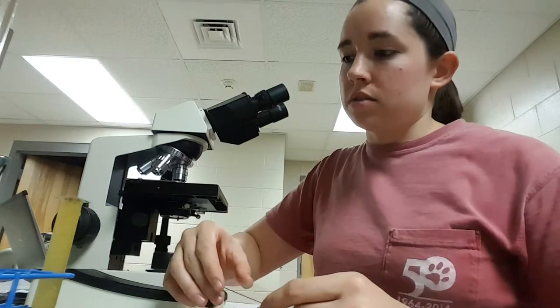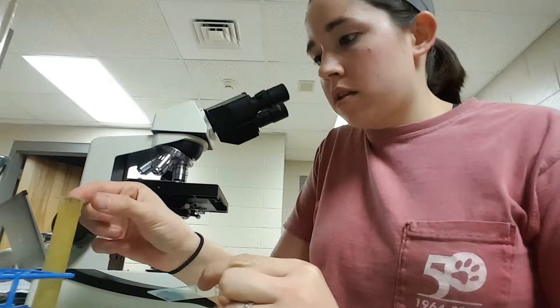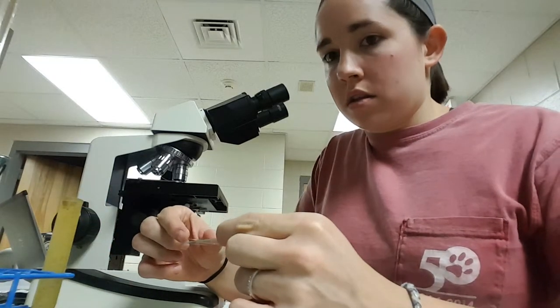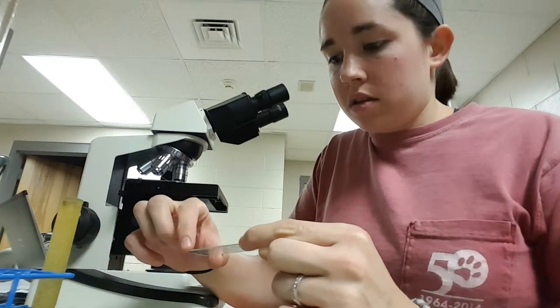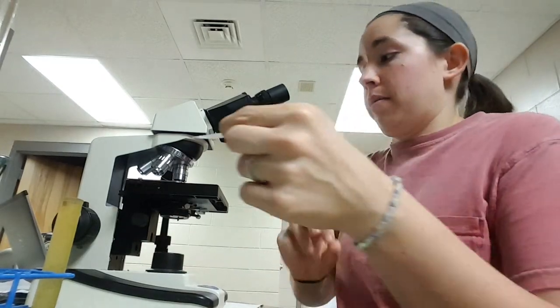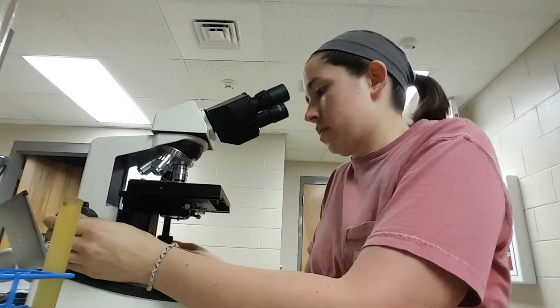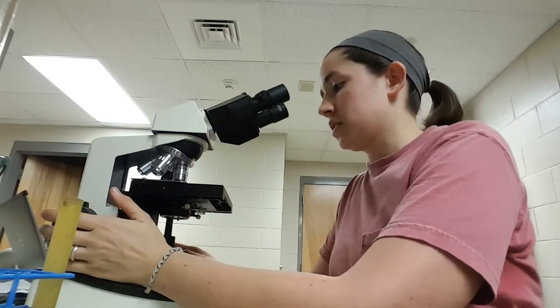Okay, 15 minutes has passed, so I'm going to remove the cover slip and place it on this glass slide just like that. I'm going to place this on my microscope and lock it in.